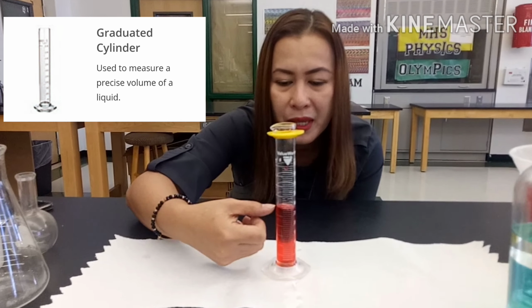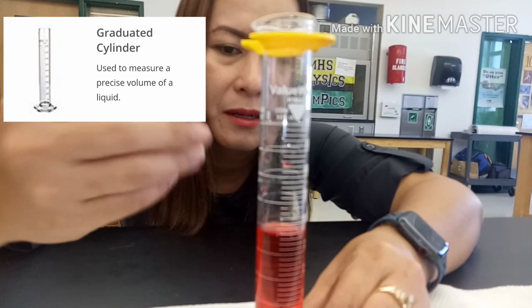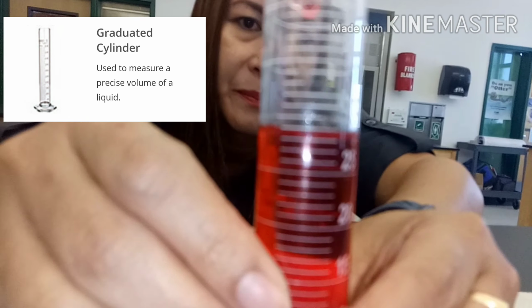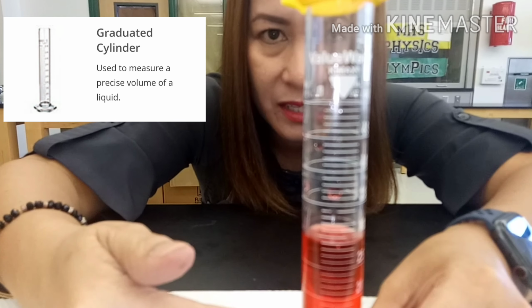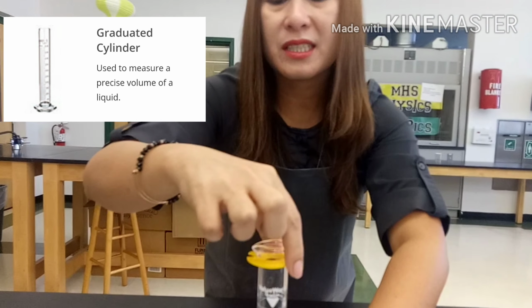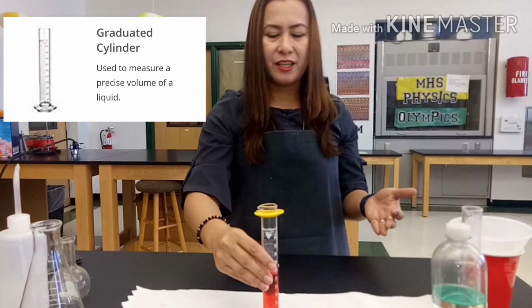Over here, we have on the side, so this one. To read this, make sure that you are at eye level with your liquid. So how much is this? Could you see that one? We have 25, 26, 27, 28, 29 milliliters for this liquid. All right. Over here at the top, we have the yellow top, which is used to protect your cylinder from toppling down. There you go.